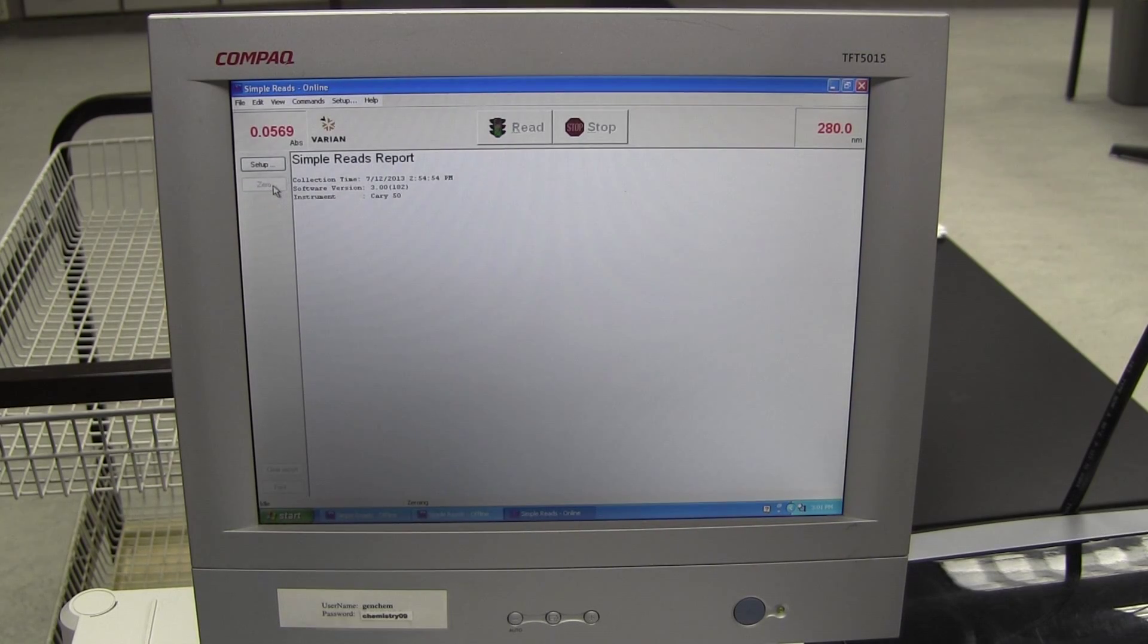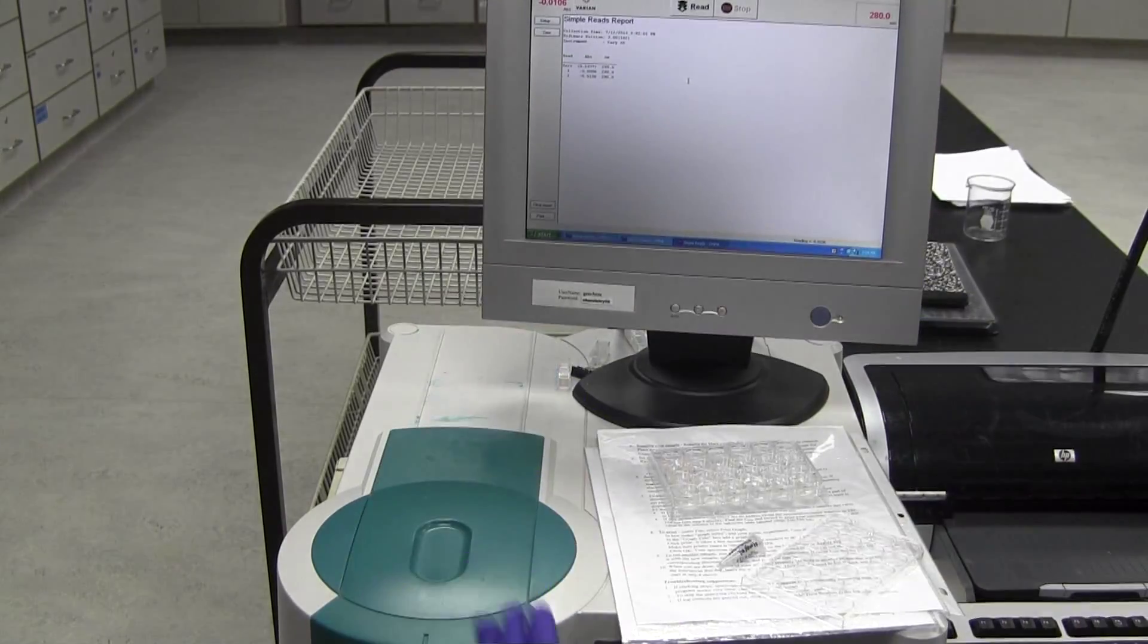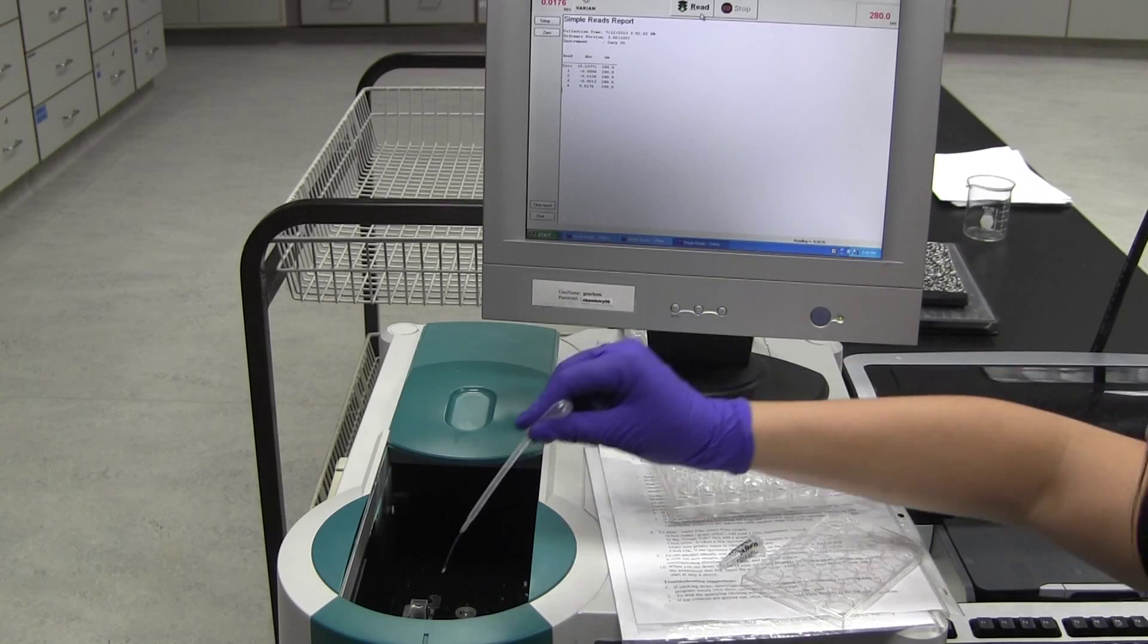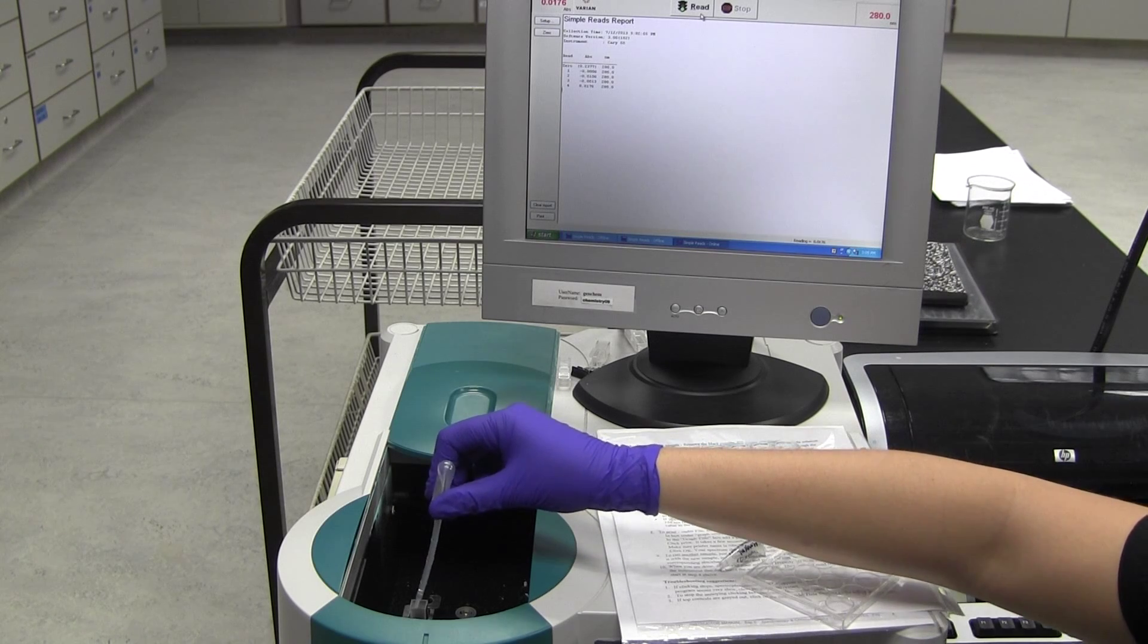Then, you can dump the buffer out into the sink. Load your first fraction into this same cuvette. Close the instrument and click read. Wait for it to finish, then pipette out the fraction into the well where you took it from, and load in the next one.